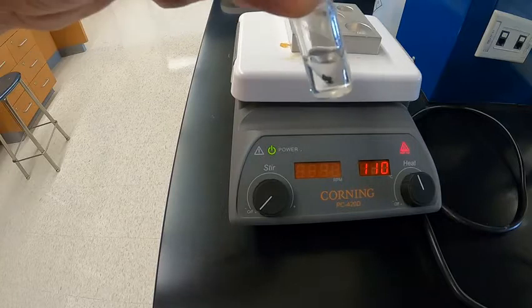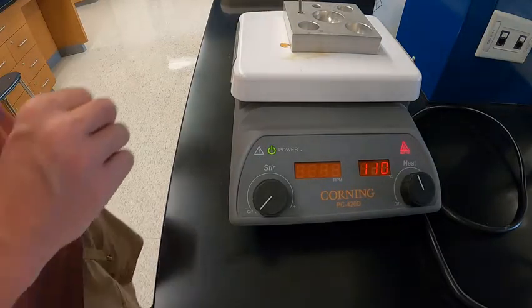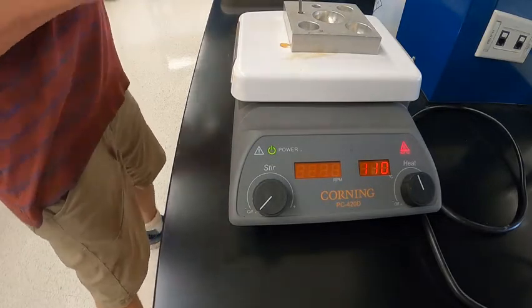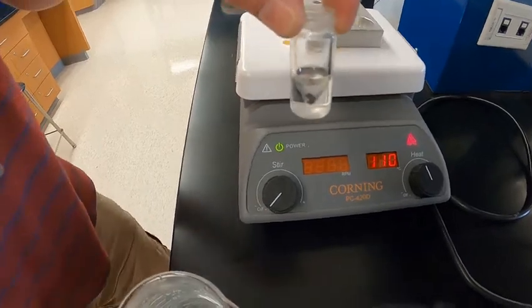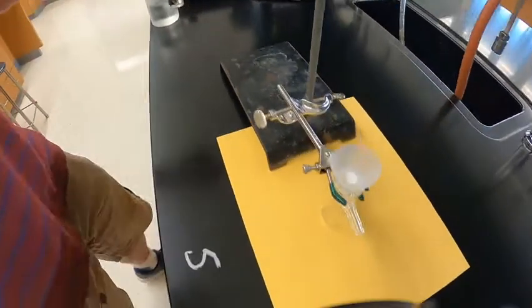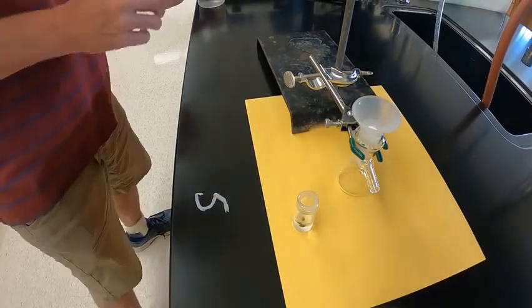So the next step in the procedure is to add a small amount of distilled cold water. So I'm going to move over to here so it's a little more visible.